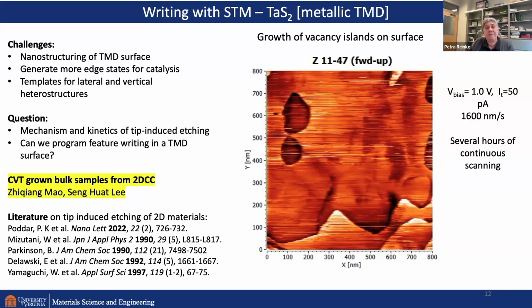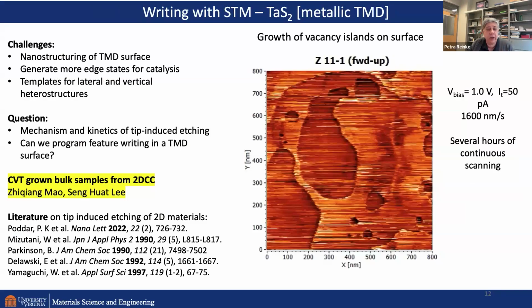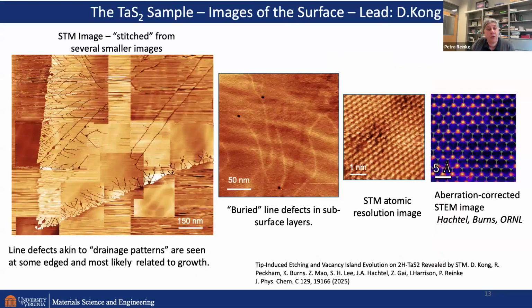So let me go to the first question, which I'm sure comes to your mind, which is: is this really tip-induced writing? I can tell you, I forgot the image here. I'll show you later to confirm that. Let me show you first the sample we started with. So you need to know what you start with before you can do anything to it.